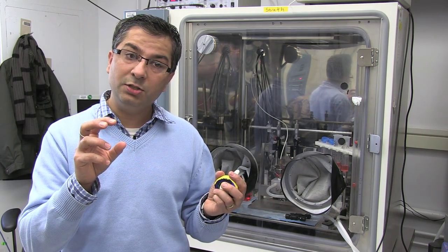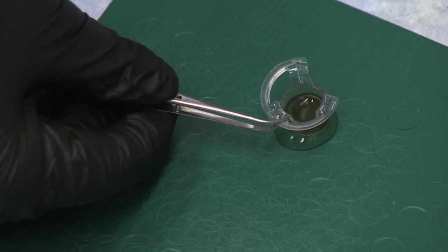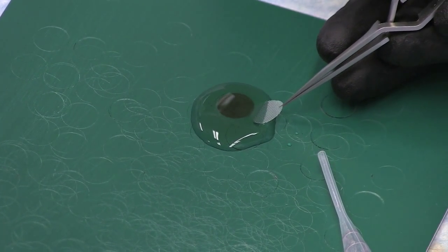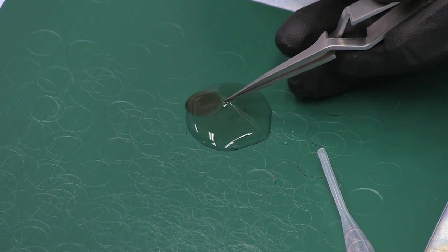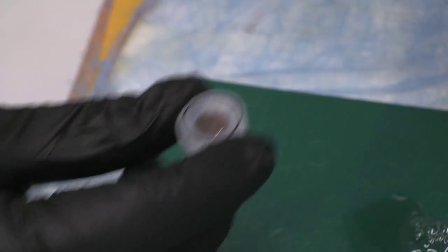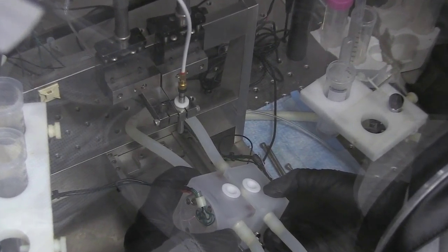We wanted to make cells and authenticate them functionally to show that these cells really function like in vivo RPE cells. So we grow our cells on a biodegradable scaffold, and that whole tissue is mounted in these physiology rigs, and we measure the function of the entire tissue, and we check that the tissue is electrically and mechanically intact, and then we check the transport of pH, calcium, and their ability to transport water and other nutrients.